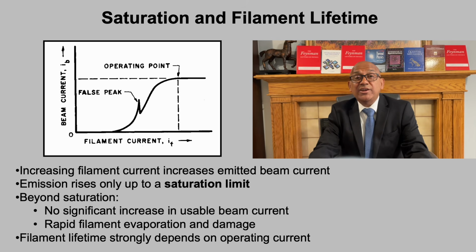Beyond this saturation regime, the extra heating mainly accelerates filament evaporation and structural degradation, rather than improving imaging performance.